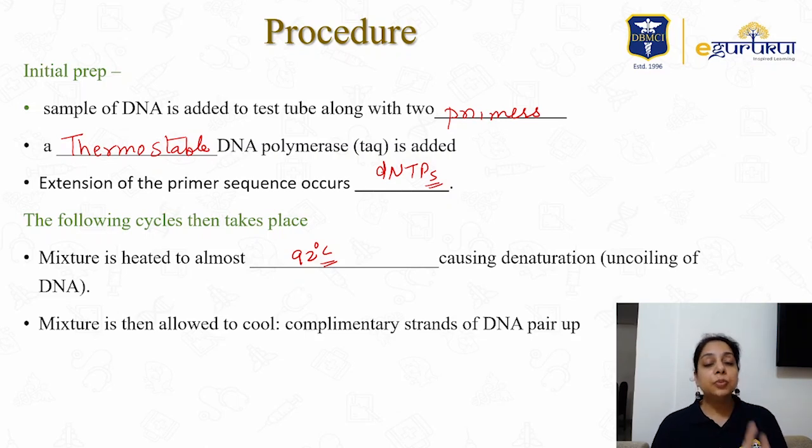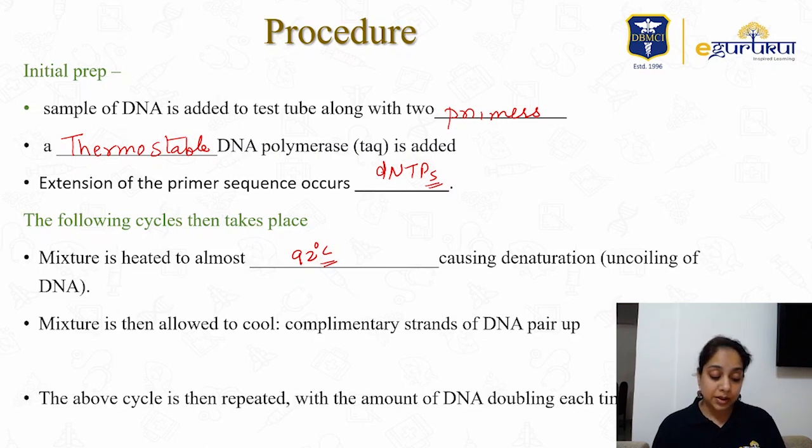So specific primers are used because now we know the entire genomic sequence of the SARS-CoV-2 virus, and we take certain genes, 3 genes. I will show you the map, according to which genes we have made the primers, the forward primer and the reverse primer, and also a probe. So the primers are specific for the COVID virus, and then this above cycle is repeated over and over.